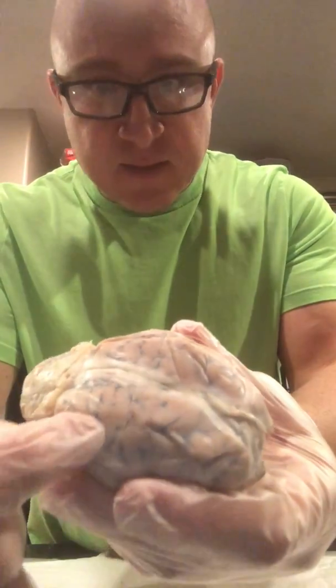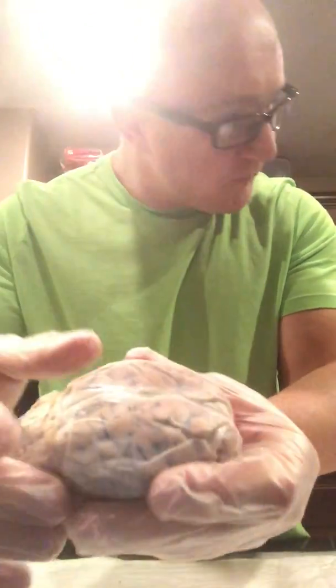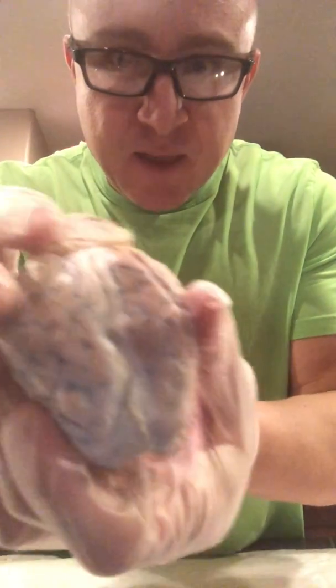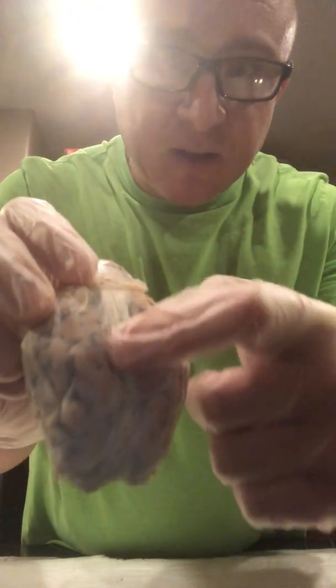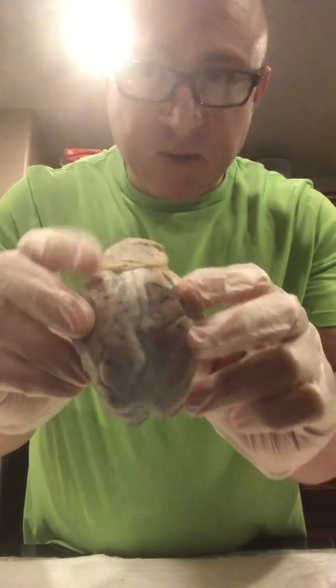The sulcus is all the lines in between the gyrus. The gyrus is all the ridges all over the brain here. The next one is the longitudinal cerebral fissure. That's going to be right here, right down the center, which separates the two hemispheres of the brain.